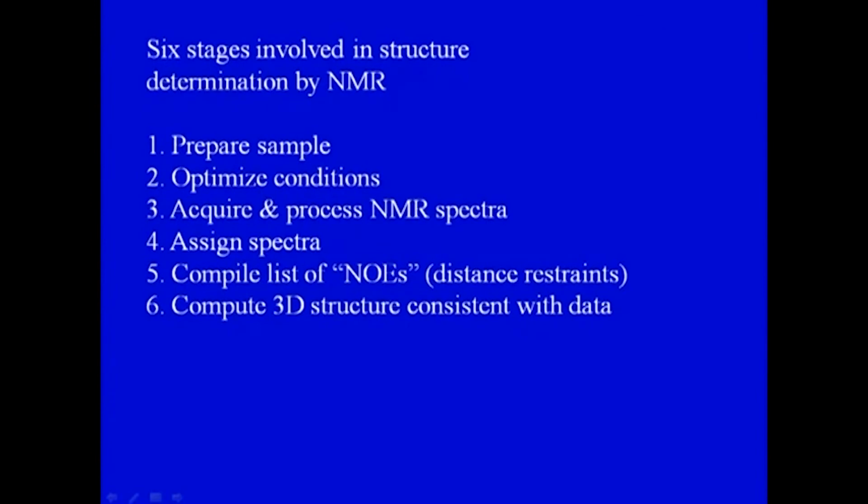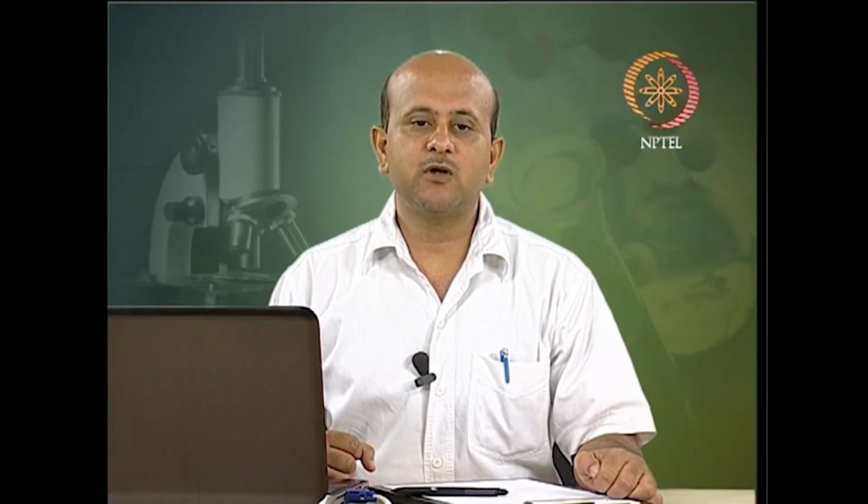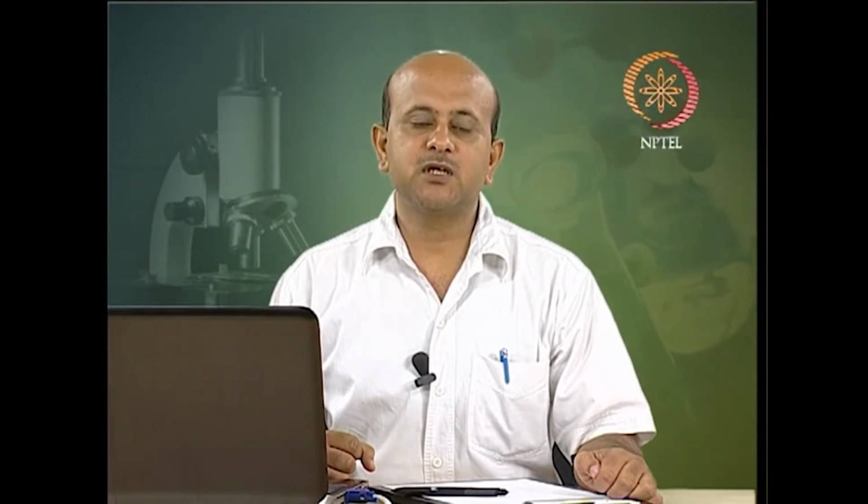Now, once this NMR spectrum is obtained on the NMR spectrometer, the peaks have to be assigned; we call it assigning the spectra. Here, different peaks are selected, and for these peaks standard values are given in a database. They can be picked from there, and by comparing with the standard values, the peak assignment can be done. So, that is another important thing.